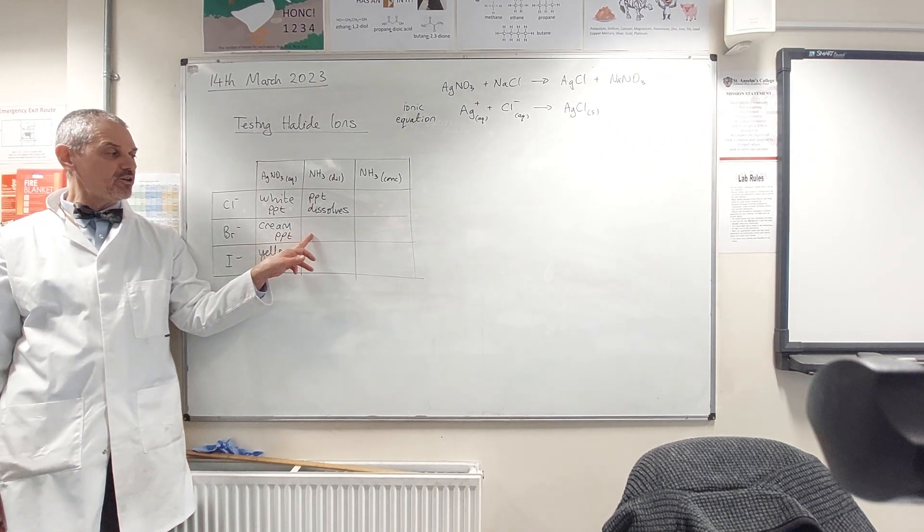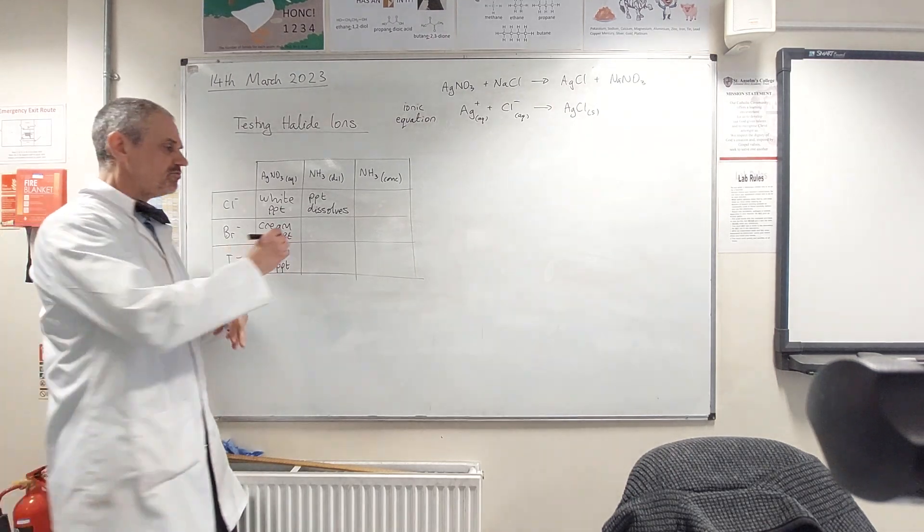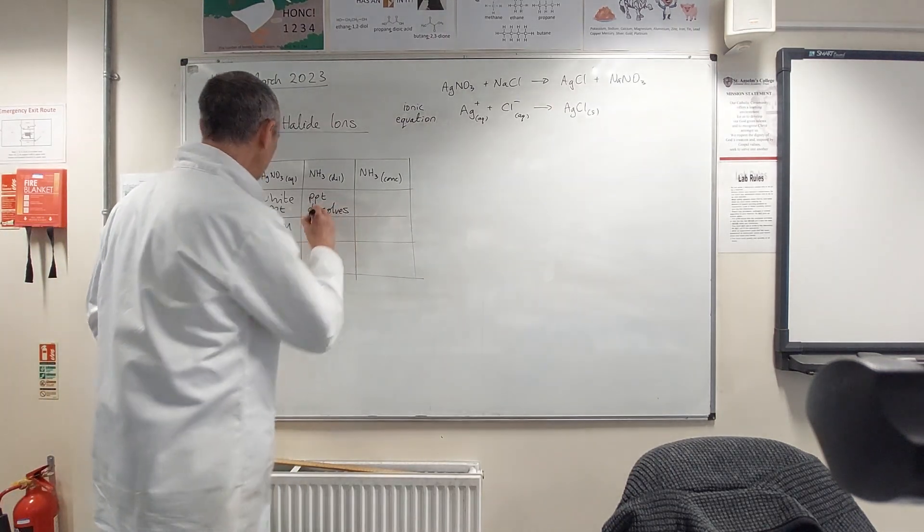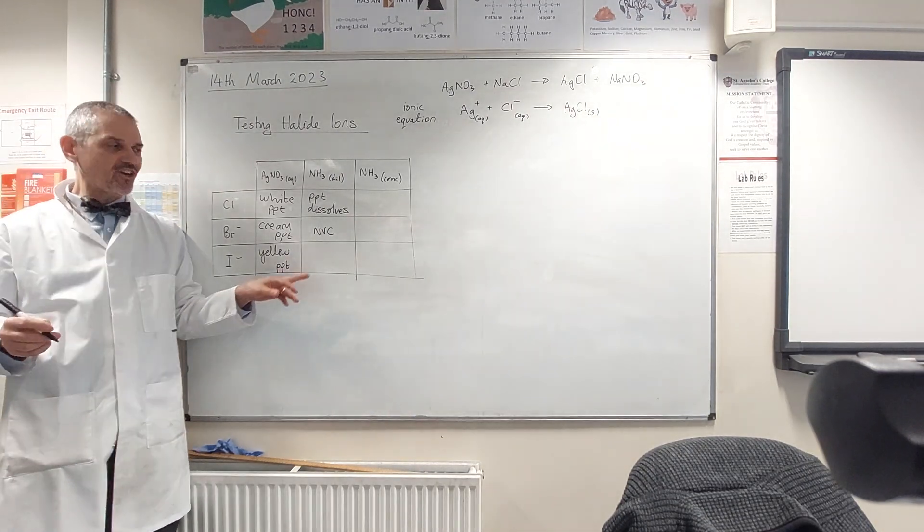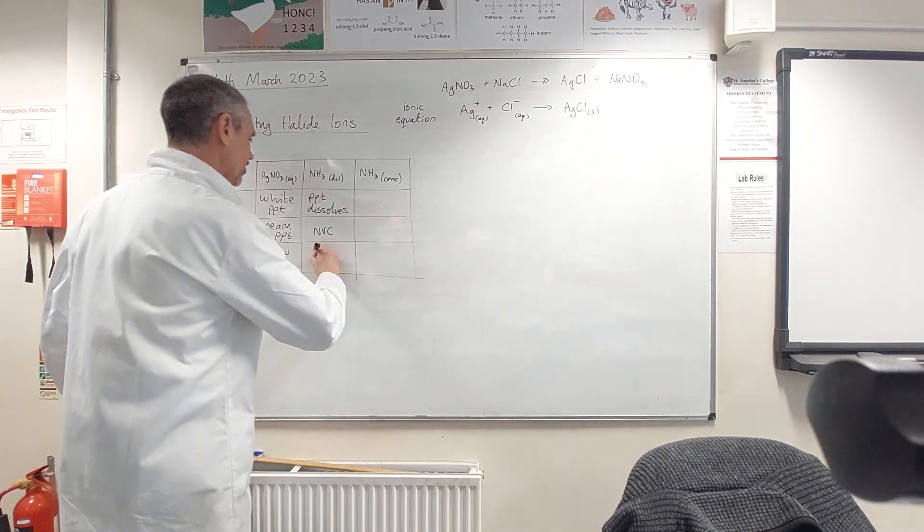Okay, if we add dilute ammonia to our cream precipitate for bromide. No visible change. Okay, just we just end up with a slightly diluted precipitate. And our yellow precipitate for iodide? No visible change. No visible change there.